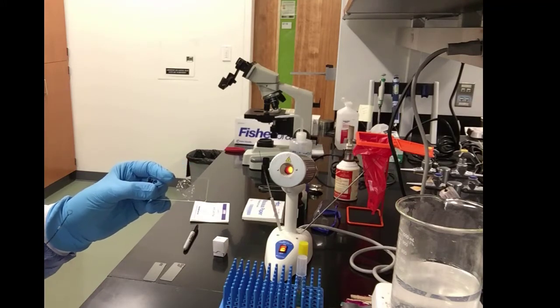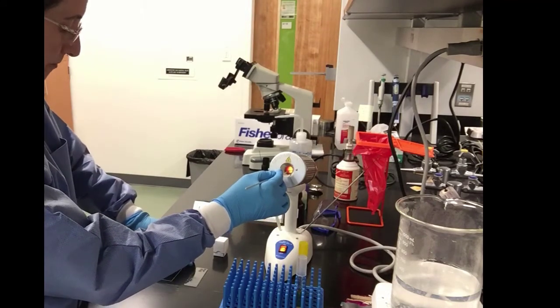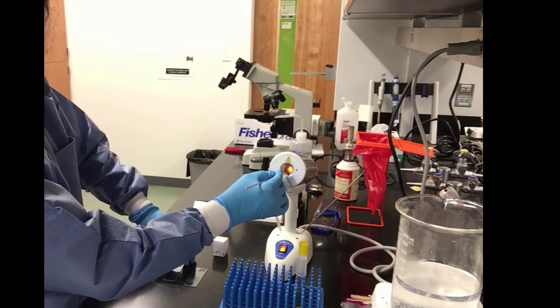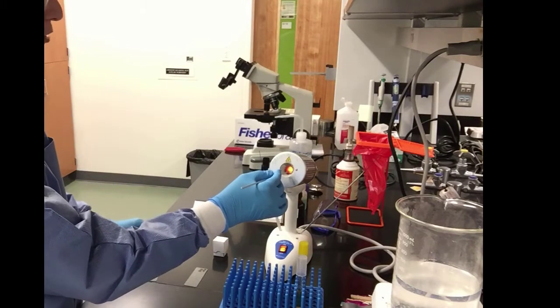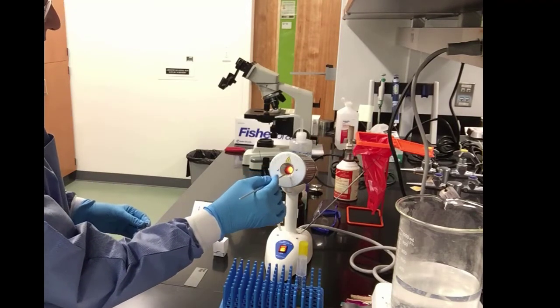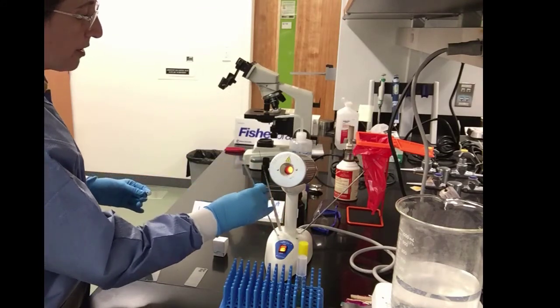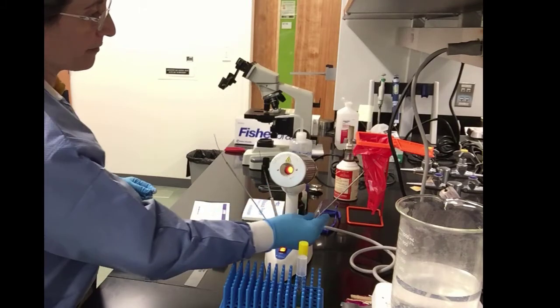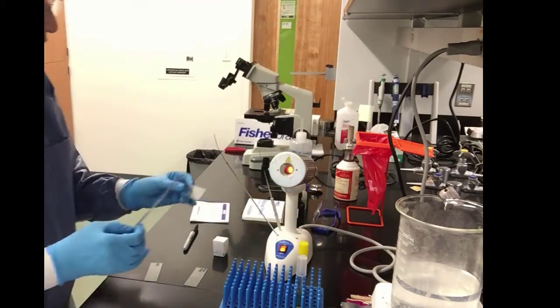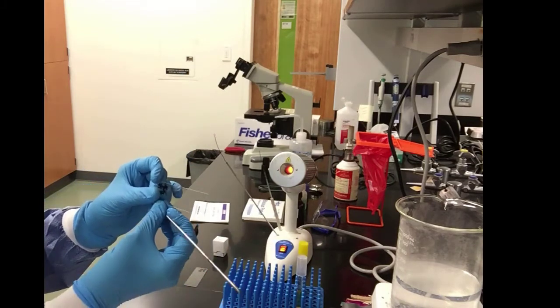So now we will move on to our next smear. We're going to make our smear of Staph aureus. Of course, we're going to sterilize our loop in between to prevent contamination. Now with the staph, if you remember correctly, the staph was growing on a slant. Because it's growing on a slant and it's very slimy and condensed, it's going to create a very thick smear.